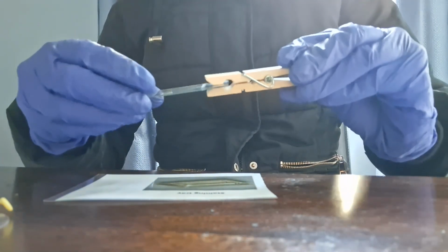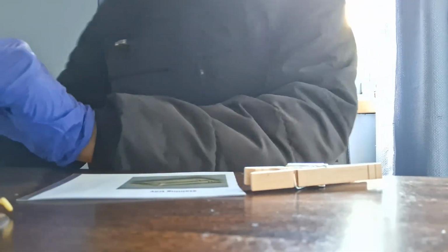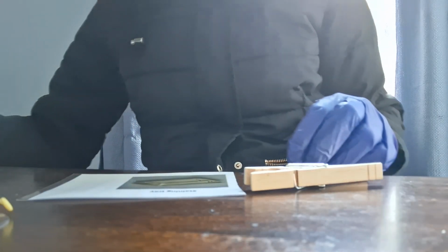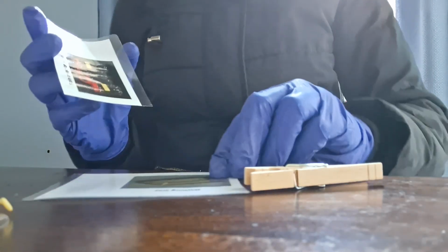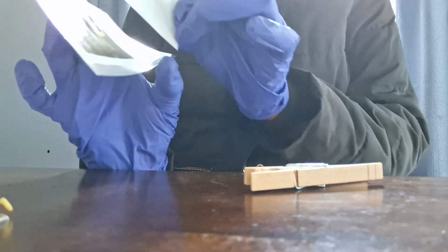After everything is done, we take the slide and put it in the sharps container, and then we put whatever water was collected in the staining tray into the stain collecting vessel.